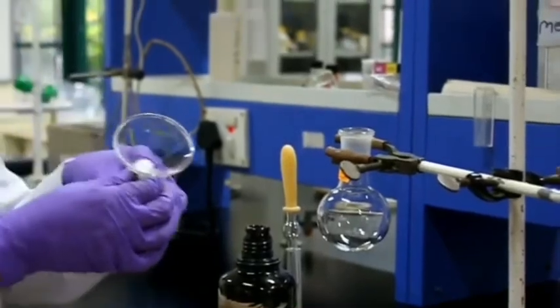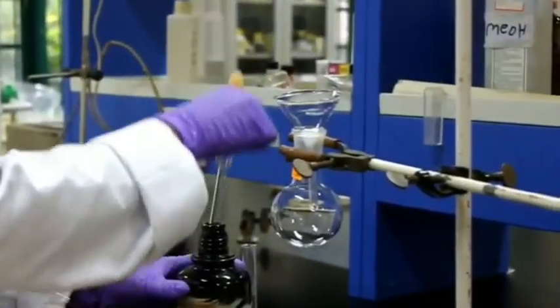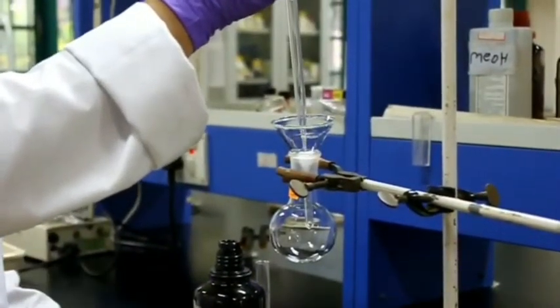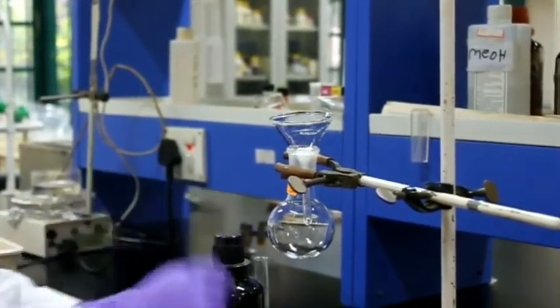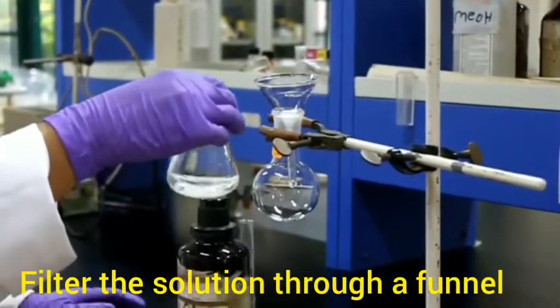Now we are transferring the organic part to an RB flask using a funnel. In the funnel, you can see that we put some cotton, which is helping to filter the organic part from the sodium sulfate.